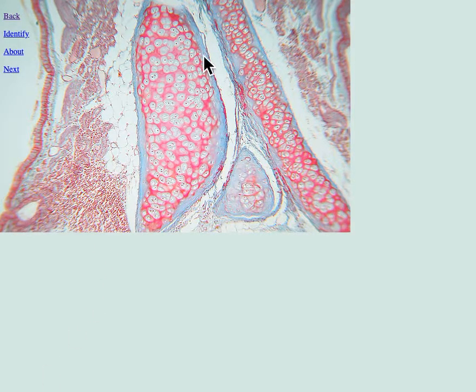And so right here you have a really good example of hyaline cartilage. I have another image next that'll blow this up. But in the matrix, you don't see any fibers. Once we enlarge this, you'll see it more clearly. It is avascular, so it has to get its nutrient needs met through this membrane called the perichondrium from the surrounding vascular connective tissues. And because the matrix is so dense, nutrients diffuse through it very, very slowly. And so if you damage the cartilage, it heals very, very slowly.